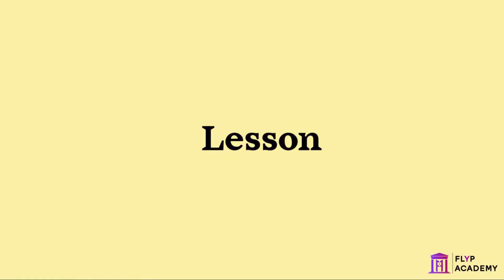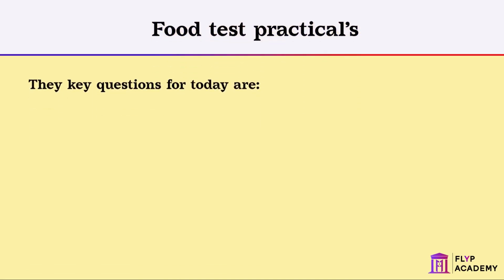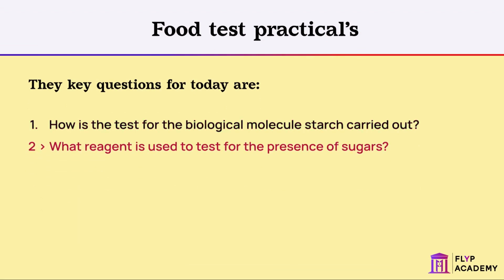Welcome to our lesson on the food test practicals. The key questions for today are: 1. How is the test for the biological molecule starch carried out? 2. What reagent is used to test for the presence of sugars?